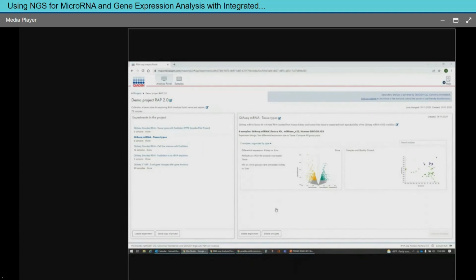All right, so I can see at least a few of you out there can see our RNA-seq analysis portal. The way that this works is when you get your FASTQ files, either they're sent to you or you get them somehow in a database or a cloud environment, you can upload them to this portal. Or if you have access to BaseSpace, we can directly pull the BaseSpace files into this environment.